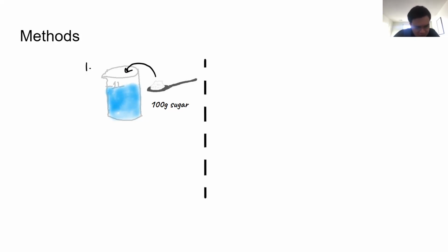In investigating the question of at what concentration of oxygen yeast switches from fermentation to respiration, our independent variable was the initial concentration, in milligrams per liter, of dissolved oxygen in the solution. Our control condition was the level of no external oxygen added. We measured this amount of dissolved oxygen in 35 degrees Celsius water to be between 9 and 11 milligrams per liter, so this was our control level. Our dependent variable was the rate of CO2 produced by the yeast. The rate of CO2 production is higher during fermentation than for respiration, so we intended for the level at which we observed a significant decrease in the rate of CO2 to indicate that the yeast had switched to respiration.